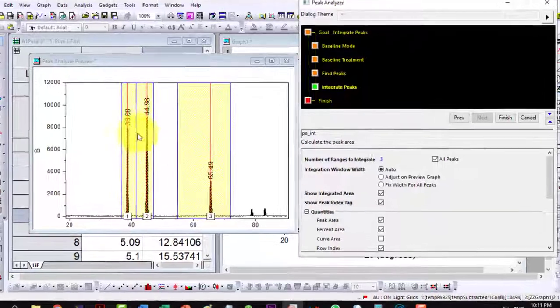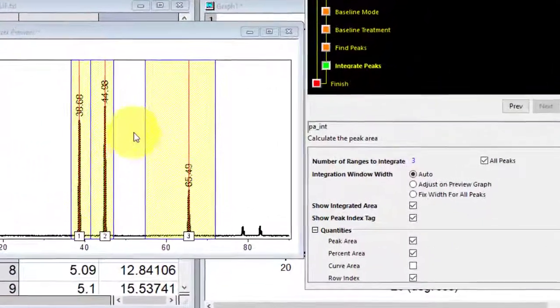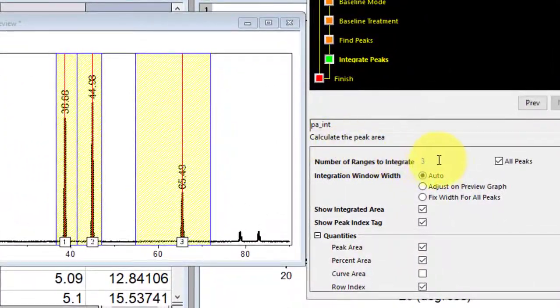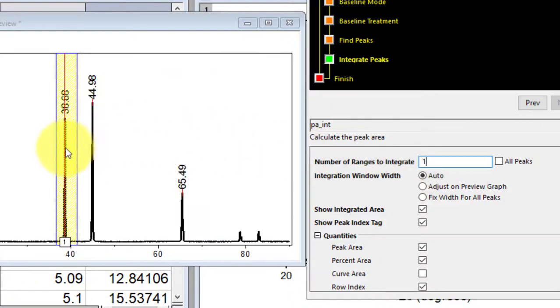Now it will indicate some area here, and all peaks are selected here, and the number of peaks are three. Now if I want to select only one peak from it, then I can untick this one, and here I write only one peak, and you see only one peak is selected.